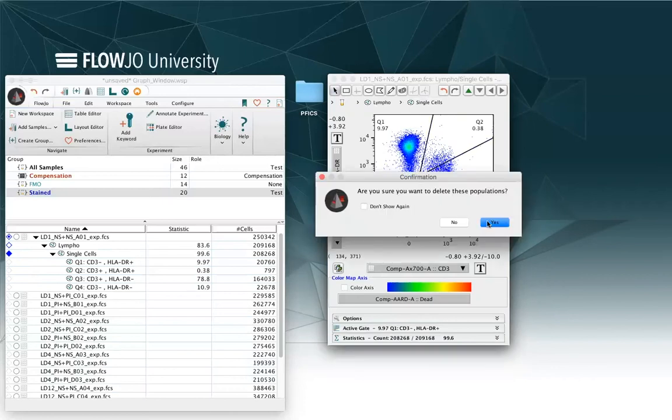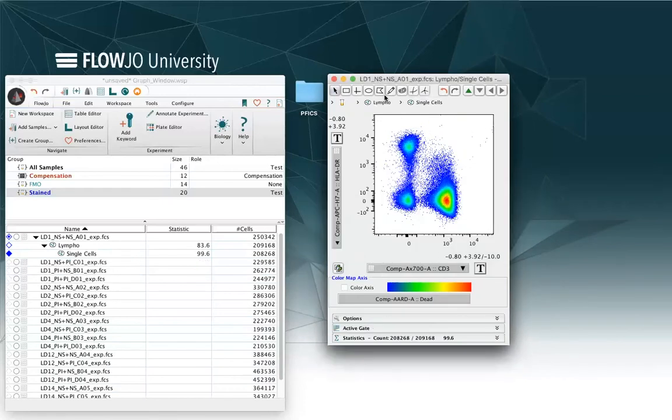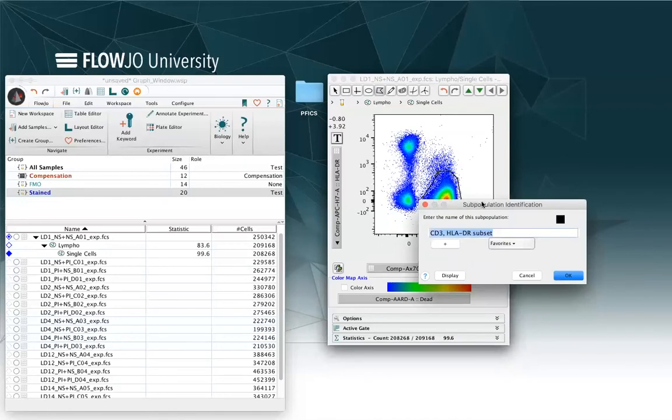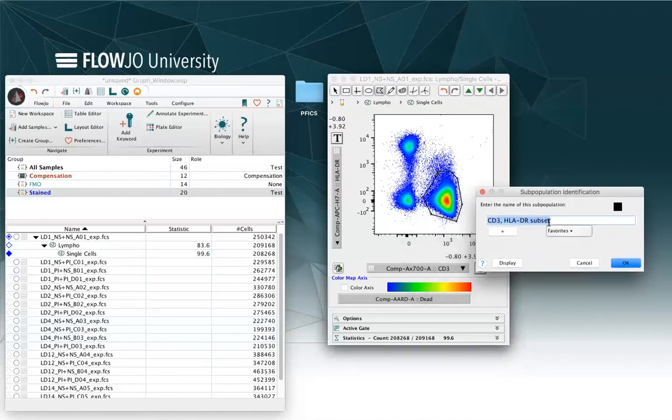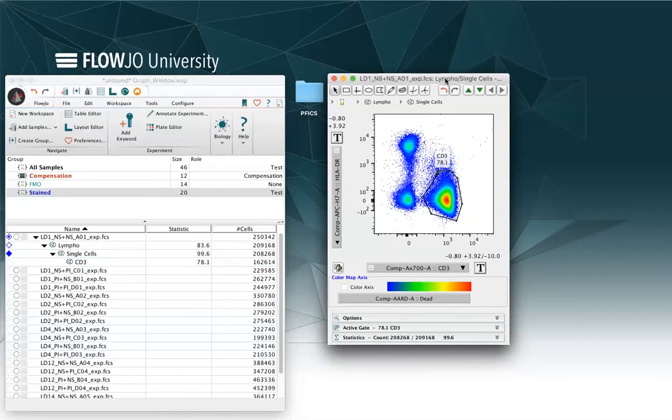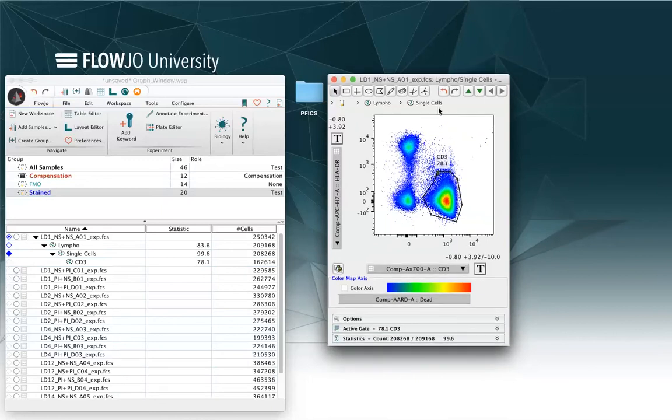I will just proceed by creating a polygon gate, for example, in this case, and call my population CD3. And when I am at this state, I can select a different visualization of the plot by clicking on options.